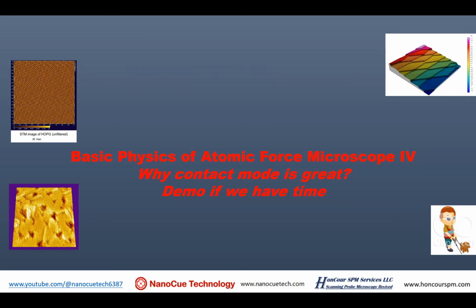And I asked myself, look at your best image. What imaging modes do you use? The best image is actually not from a lot of very complicated modes. Sometimes it's just contact mode. So I thought, contact mode, that's a good topic, because I would like to make the point that the atomic force microscope is a difficult instrument to master, and the image that comes out highly depends on your skill and your understanding.